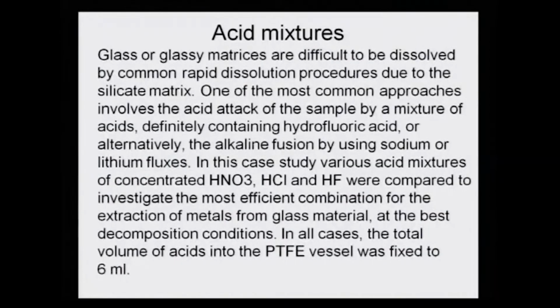But that is not the story when we are analyzing silicate matrices or glass samples. Why? Because they have a very complicated and very tightly bound structure. One of the most common approaches involves acid attack of the sample by a mixture of acids definitely containing hydrofluoric acid, or alternatively alkaline fusion using sodium or lithium fluxes.